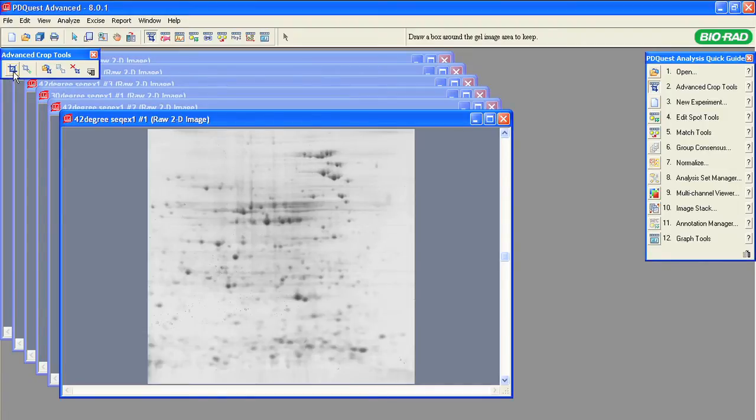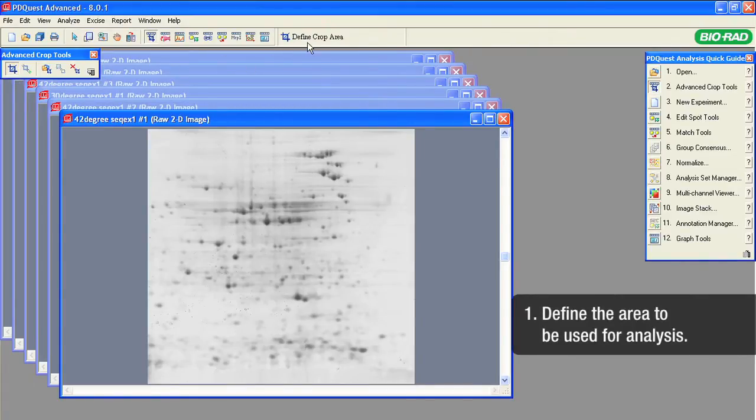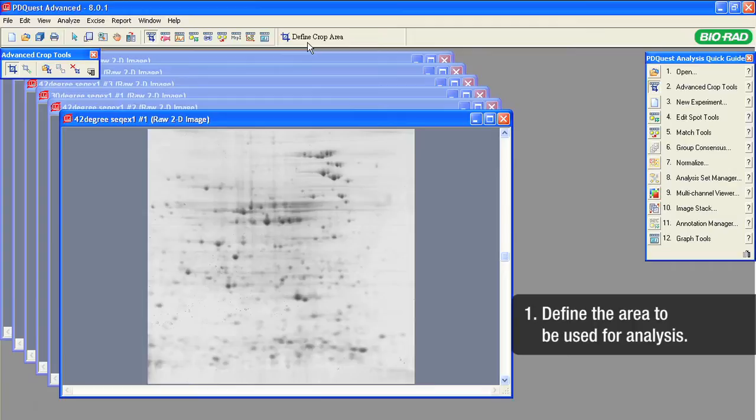First, we will define the image area that we want to keep for analysis. Click on the first button, Define Crop Area. Notice that PDQuest software displays the selected function's name and definition on the main menu bar.